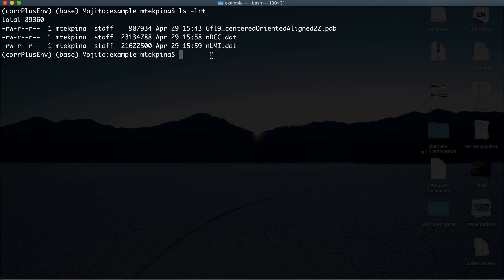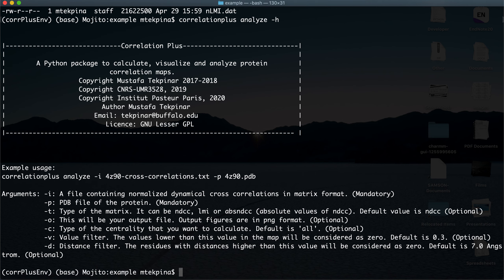Now I want to analyze my correlation data from a network analysis perspective. Let's check first if our module is correlation plus analyze, and I recommend you to call help to see the available options. For the analyze module, you need an input file — either an NLMI file or an NDCC file — and you need a PDB file.